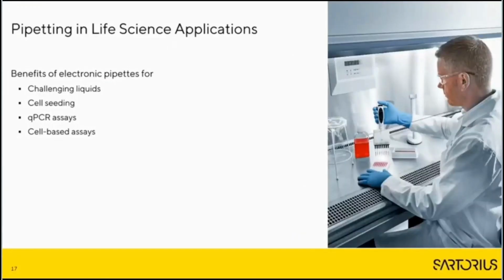Thank you, Joni. So I will start here with talking about pipetting in life science applications. Even though pipettes are used every day in labs, pipetting practice is not a topic that laboratory professionals tend to care about. Many are self-taught and have never received formal pipetting training during their career. As a result, many scientists may not know when to use forward or reverse pipetting or how the pipetting technique can affect reproducibility of results. Next I'll show some examples and discuss why electronic pipettes are beneficial in life science workflows.